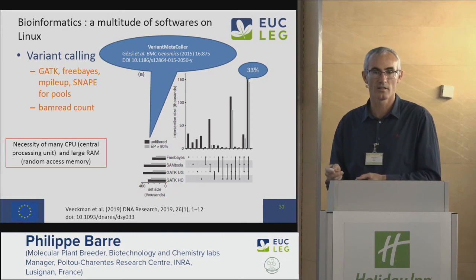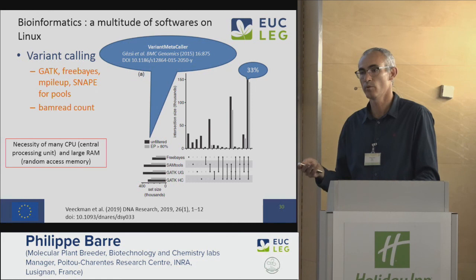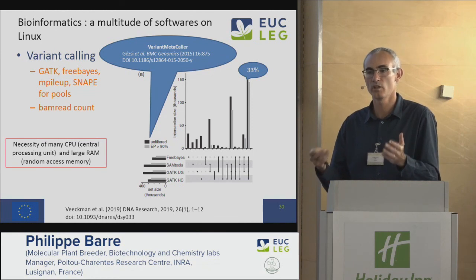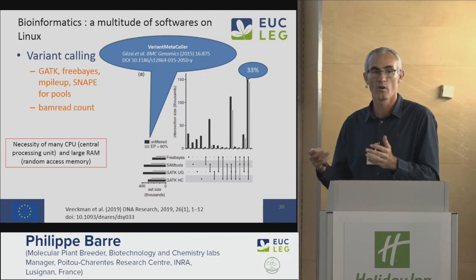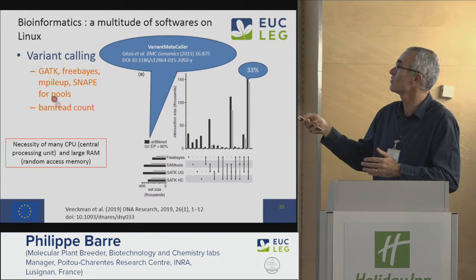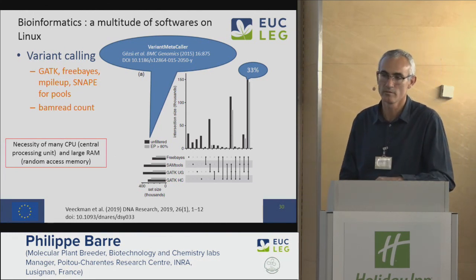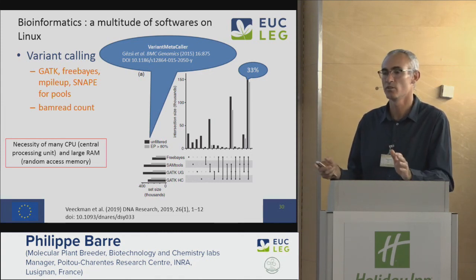Okay, this is the way it is. But often people don't realize that. So I think what I want to say here is just be aware of what you're doing when you're using this software. If you just say, okay, I use BWA and GATK, and you don't check what you have, it will work, it always works. But you can have false positives.